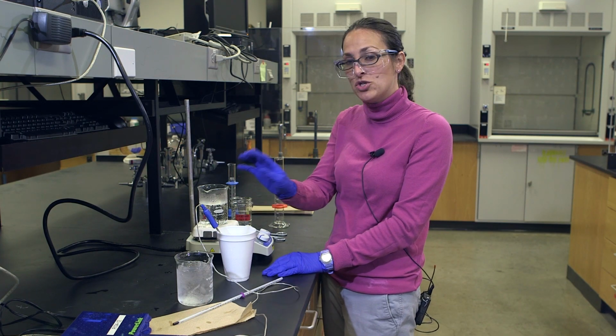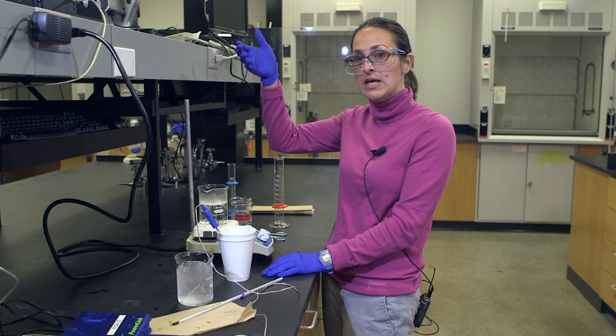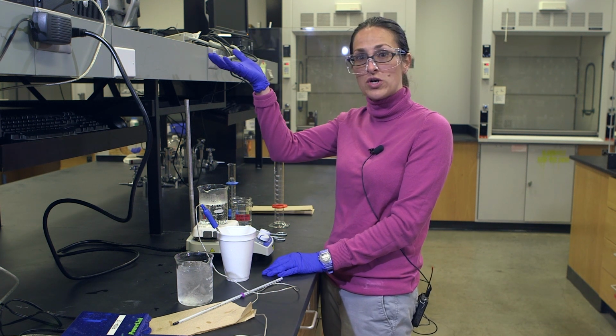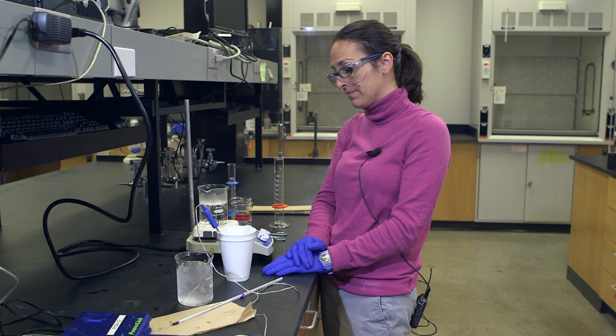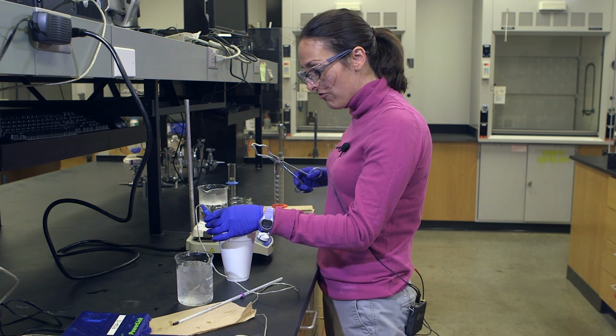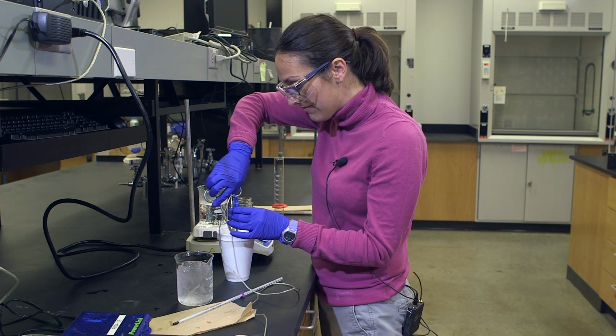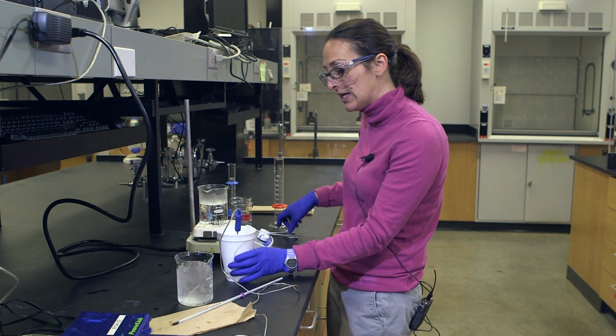And then my temperature probe, which is still in there, is going to be recording the change in temperature. So after a while, we'll record our final temperature and we'll use that in our heat capacity equation. So that's experiment 10.